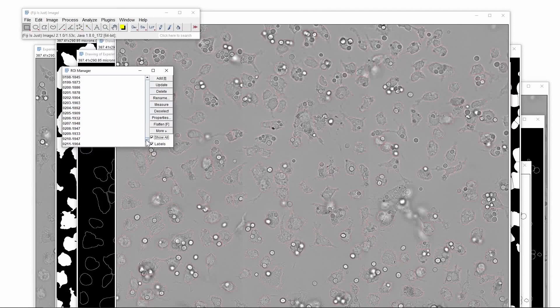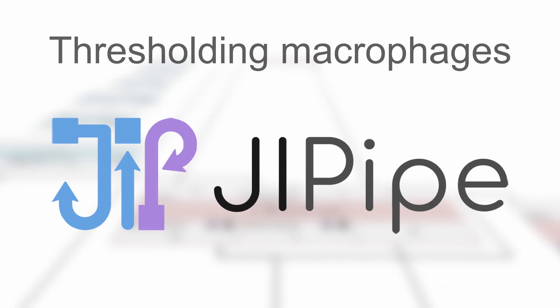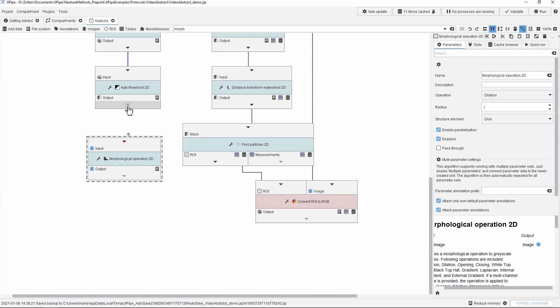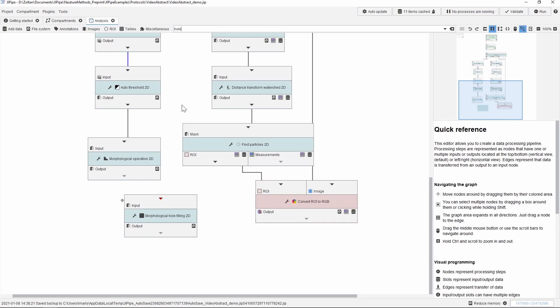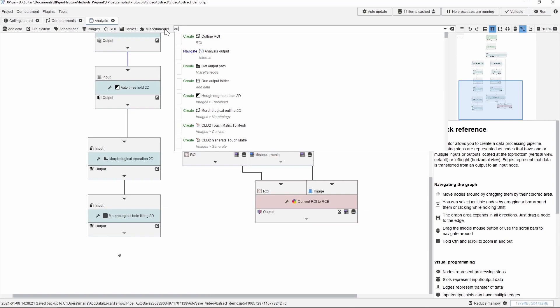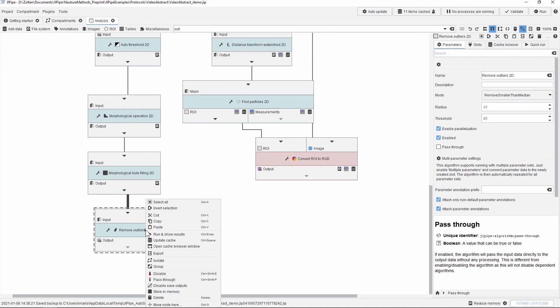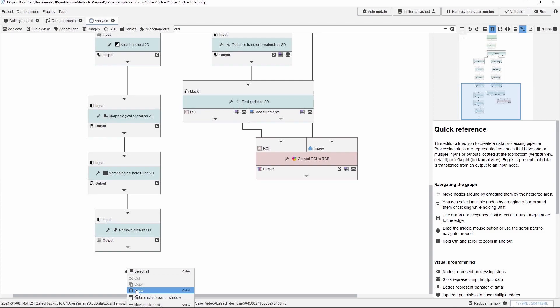Now let us carry out the same processing but in Jipipe. We continue with morphological operations using the Morphological Operators 2D node, choosing the closing operator, disk element, and 2 pixels radius. Next we connect a Morphological Hole Filling node. Jipipe also has an equivalent node for the Remove Outliers command. We add this, connect it, and set up the parameters to the same values as in ImageJ. Since we need to repeat this step we use copy and paste to make a second copy of this node, and then only need to change the radius to 20.